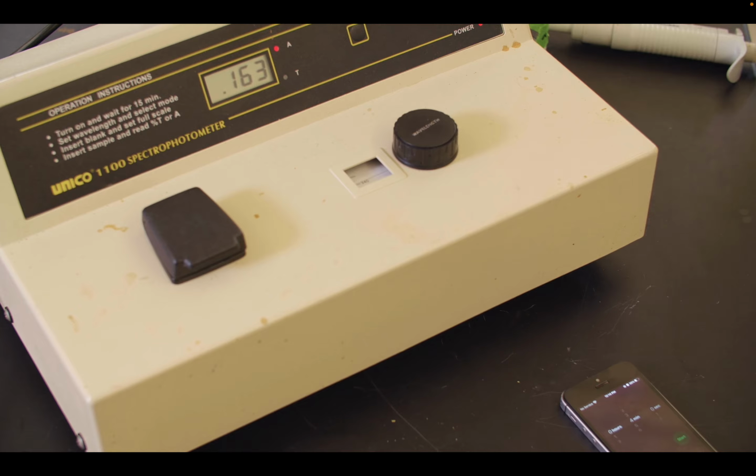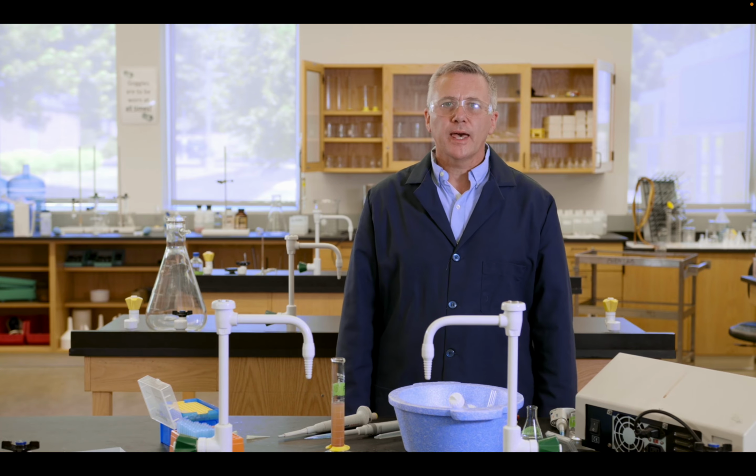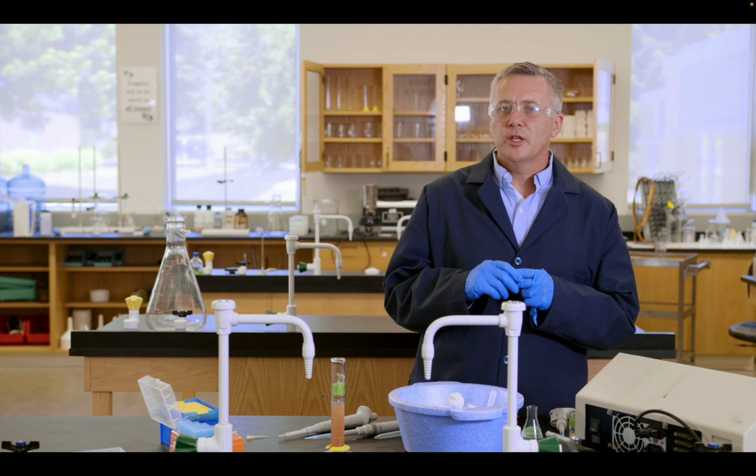Right, so that was a 4-minute assay of GOT activity. The goal of that was to get a curve that's relatively linear over 4 minutes. That is, basically activity continued over that 4 minutes. And we roughly saw that in this particular case. And so we know that we have GOT activity, or what resembles GOT activity. And so that's a good thing.